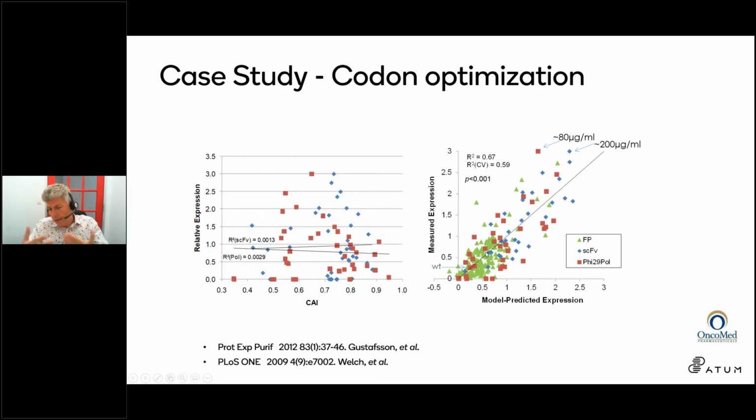And then in this case, we also had an additional protein, a fluorescent protein, a GFP. And then we can again overlay that in the exact same algorithm, showing that there's a significant correlation between different codon biases in maximizing heterologous protein expression. But it has nothing to do with being the most common codons. There are just certain codons E. coli likes to have in abundance when it's making high production, and some it hates to have. And we can actually capture that in a real live model using the DOE.